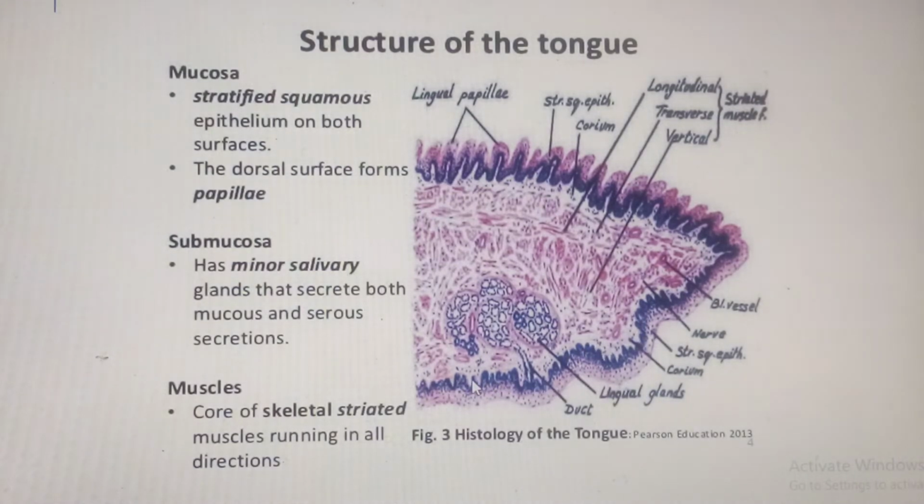So it tells you that in the dorsum, in the anterior two thirds of the tongue, we have both primary papillae and secondary papillae, by way of the connective tissue papillae, which invade the vicinity of the epithelial lining. But in the case of the ventral aspect of the tongue, because we do not have primary papillae, it makes sense that we have only connective tissue papillae over there. So that's what I want you to know.